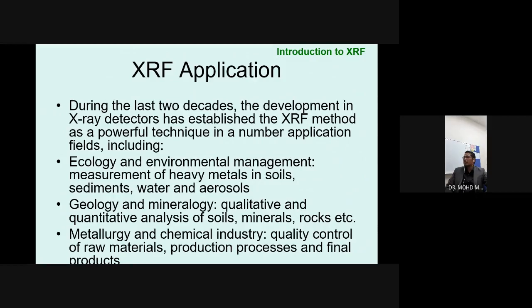In a bigger perspective, XRF has been used in many applications. In the last two decades, the development of X-ray detectors has established the XRF method as a powerful technique in a number of application fields, including number one, ecology and environmental management. Let's say you want to determine how much heavy metal is in a specific place, like by the sea. Okay, you want to see how much the beach is being contaminated by heavy metals because it is close to the oil and gas platform.